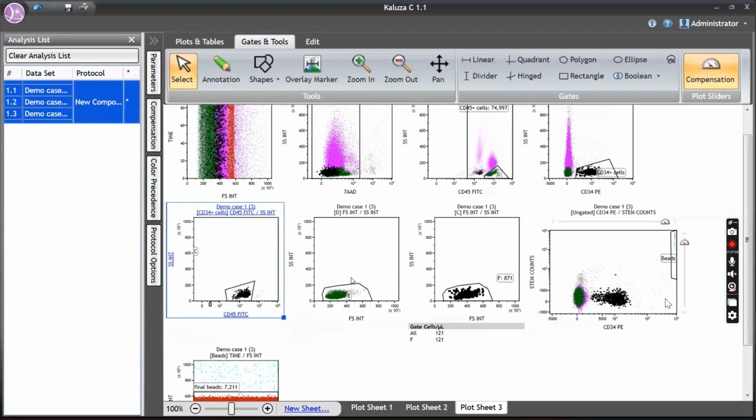See, basically what I'm doing is, once I've refined with CD45, that is, I've selected only CD34 positive events which are showing CD45 dim intensity, after that I still want to refine it with scatter. So here I'm using lymphocytes as a control. Getting the lymphocytes in forward scatter, side scatter, I'm just gating a region around it. So I cannot find a stem cell or a CD34 cell which is smaller in size than lymphocytes, correct?